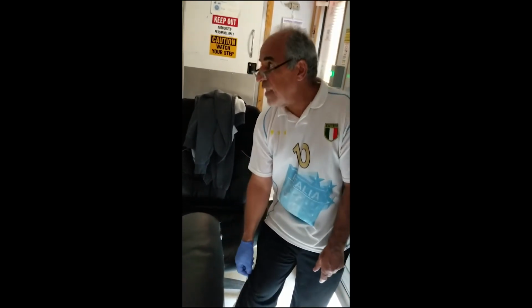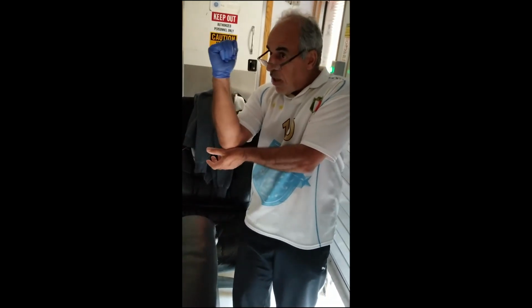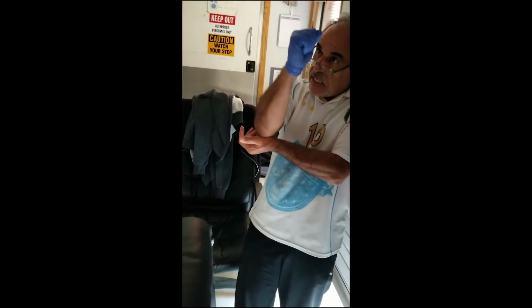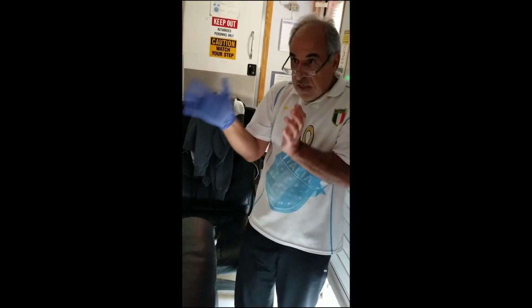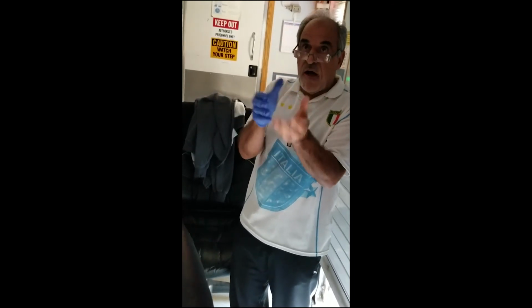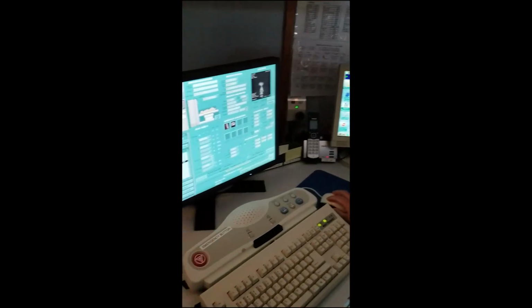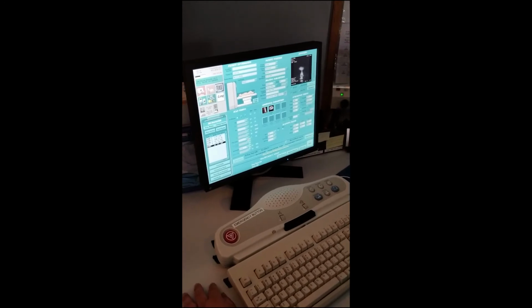So you want to go at least a little bit high, enough for me to see something. You want this at least a little bit so that I can harvest something. So even 30? 30 is good. Usually some people go 20, 25. So minimum, but on the TE in this system, it lets you take minimum full on the top. Minimum.